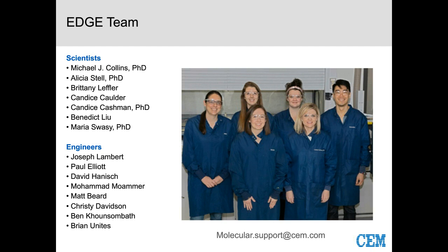Excellent. When you say in-cell cleanup, how does that work? I think that's pretty crucial to this study because the EPA methods, at least for water, are calling for that cleanup. Potentially it's going to be written into the method, so you're going to have to do some sort of cleanup. So we certainly need to make sure that we are addressing that on the Edge.